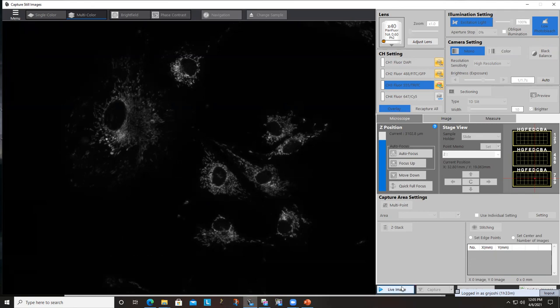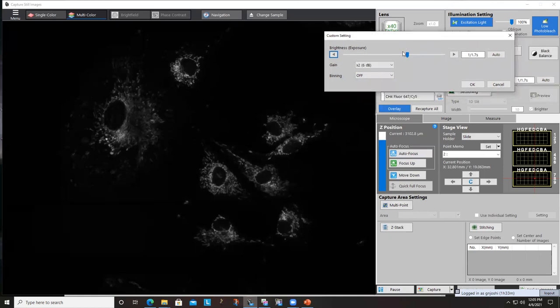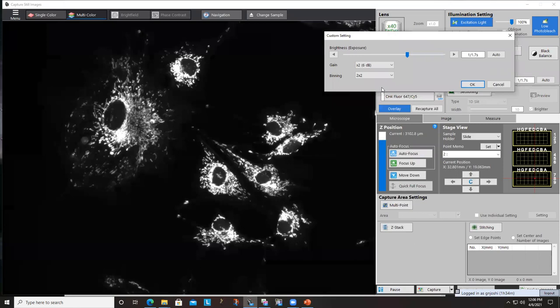All right. So going back to live image, and this is something that I did not talk a lot about because I covered this. Again, you can go to custom. We can change the binning, right? So that gets higher. Keep the binning off.